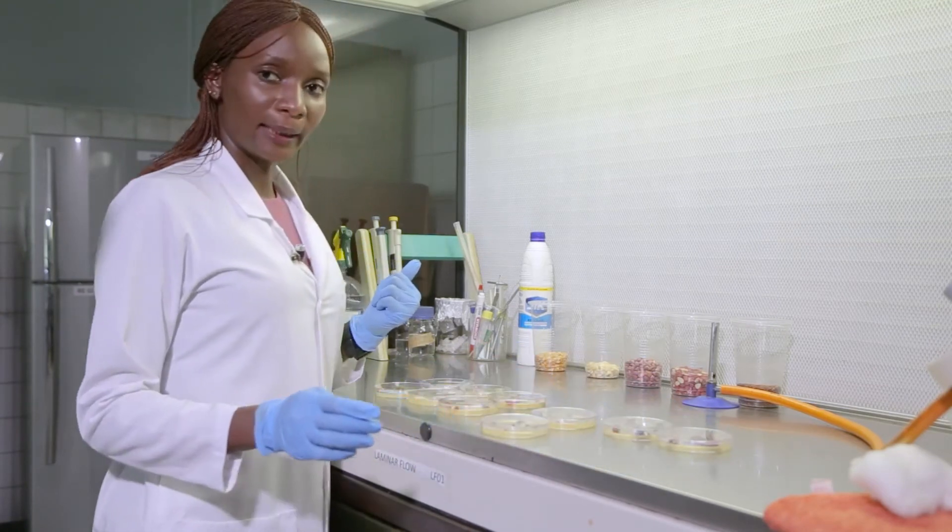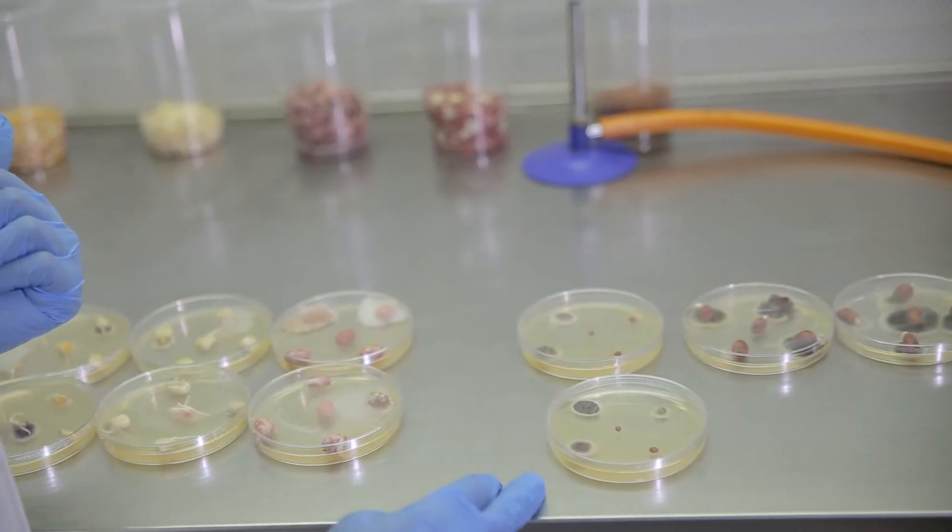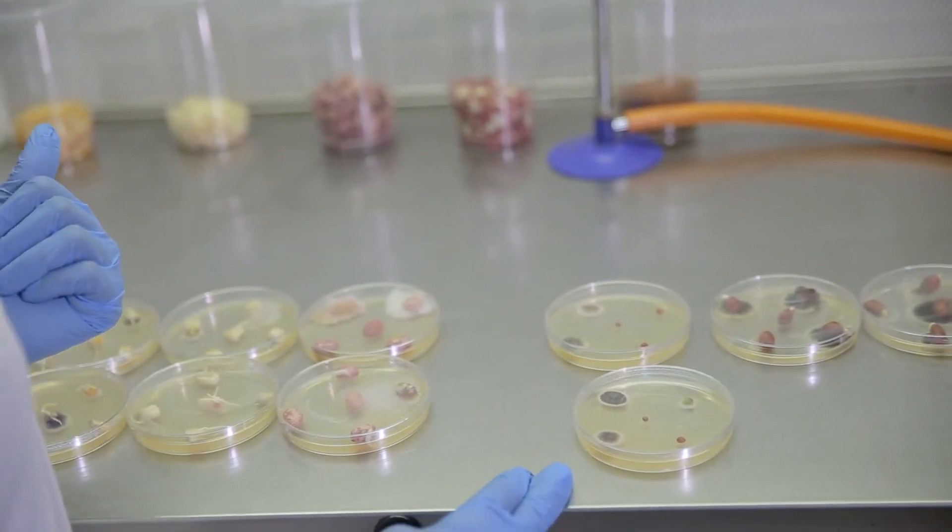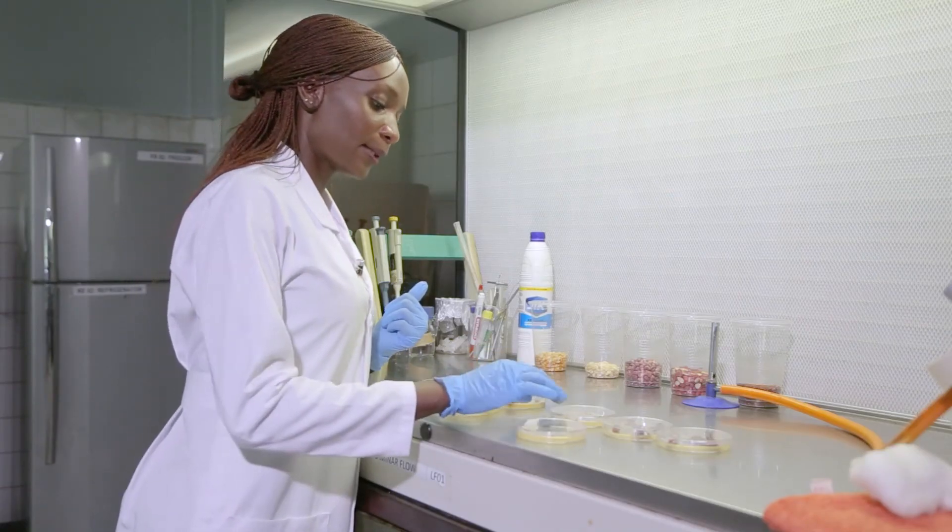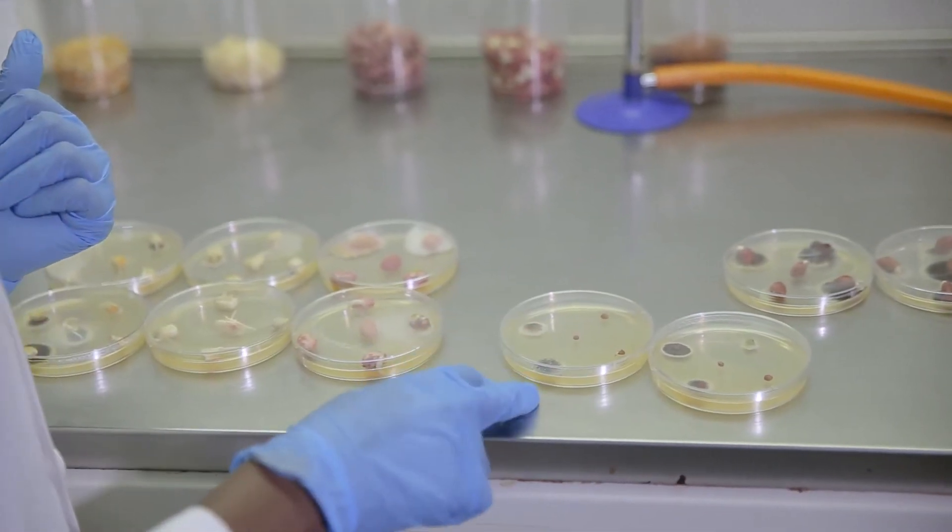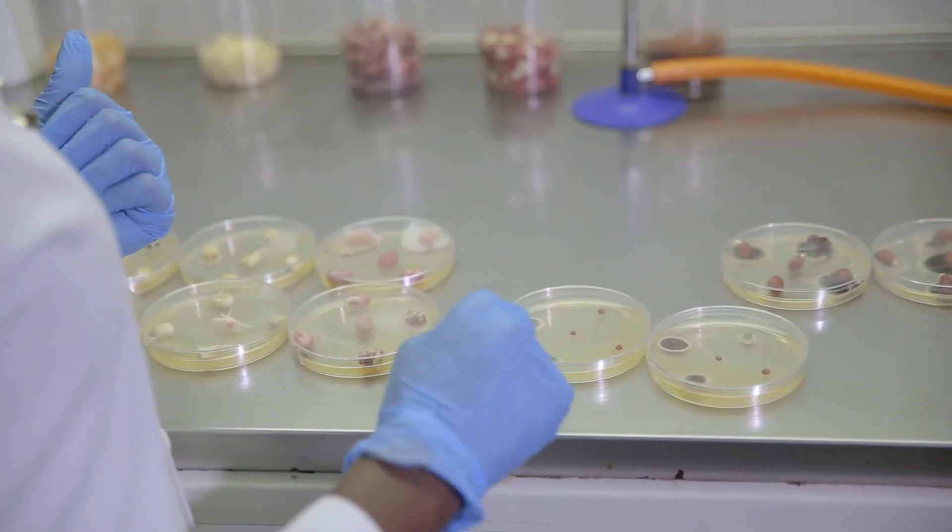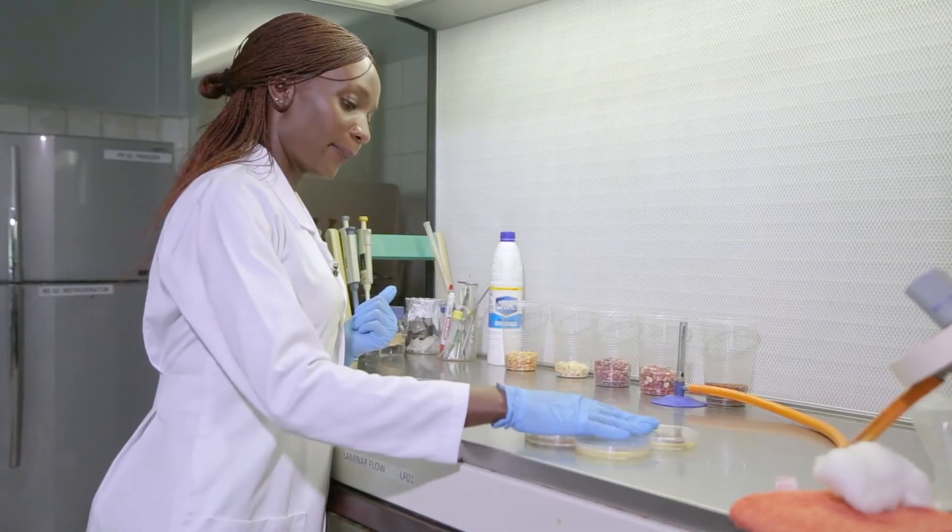In contrast, when we look at the millet, we have just 3 out of 5 infected. So that will be 3 out of 5 times 100, which is 60%. And then here we have 2 out of 5, which is 40%. So we'll get the average of 40 and 60, and we'll report that as the percentage infection.